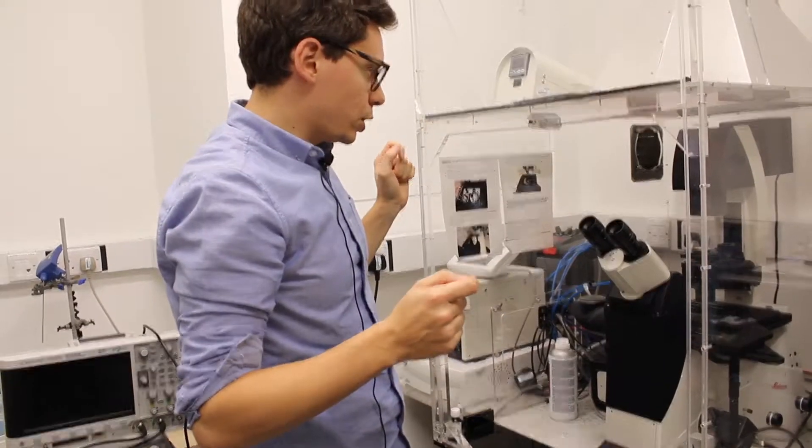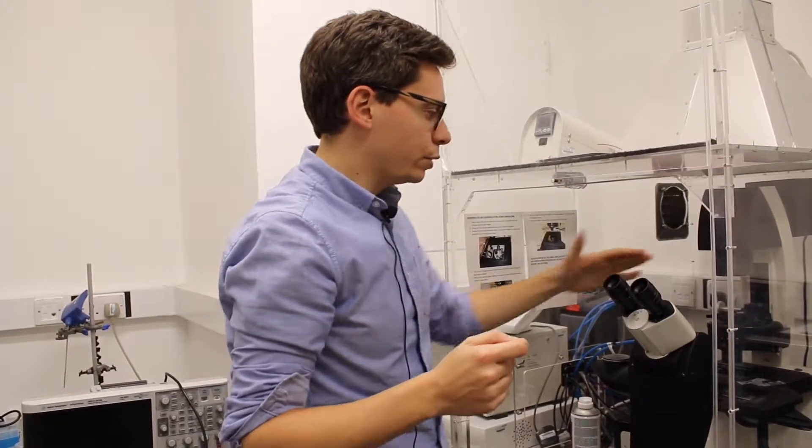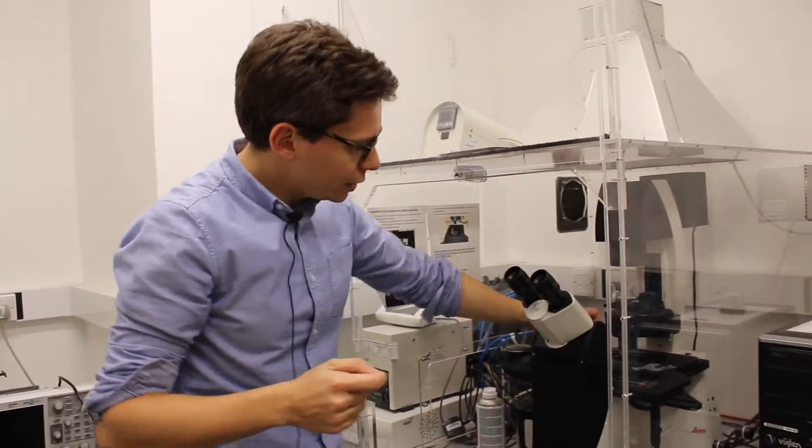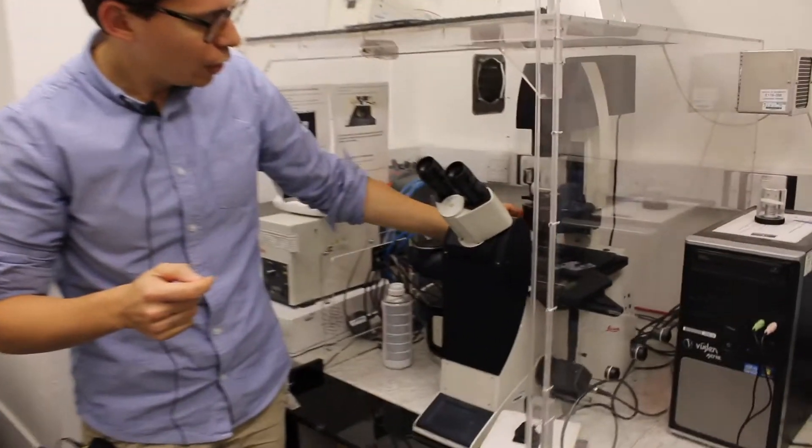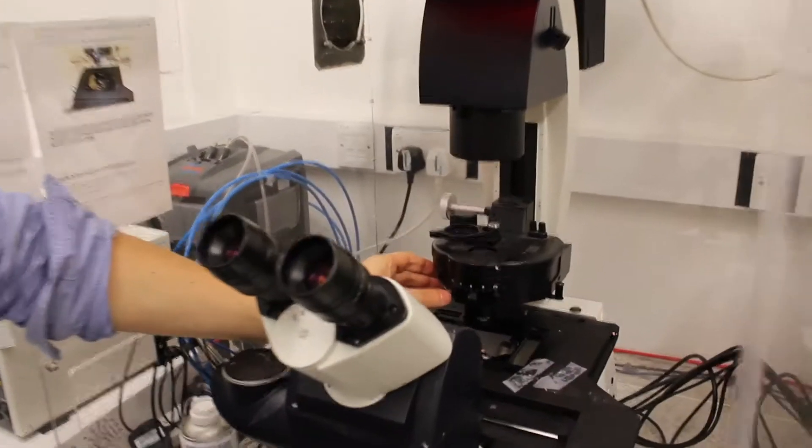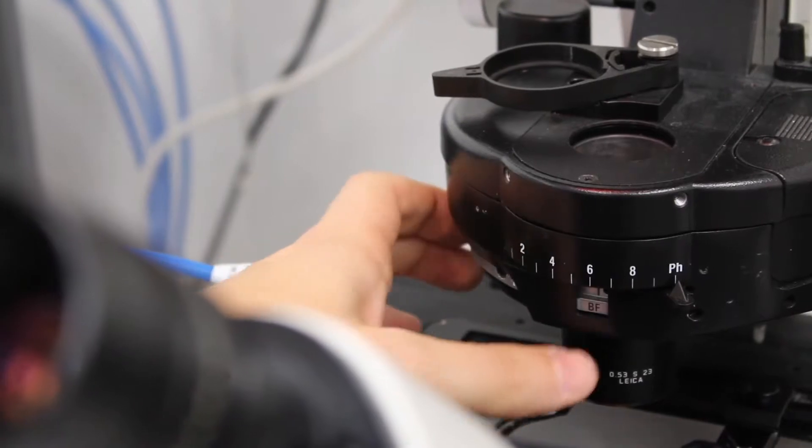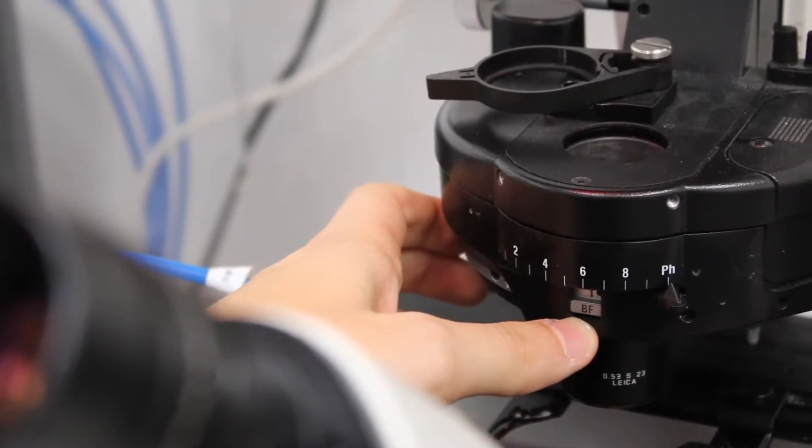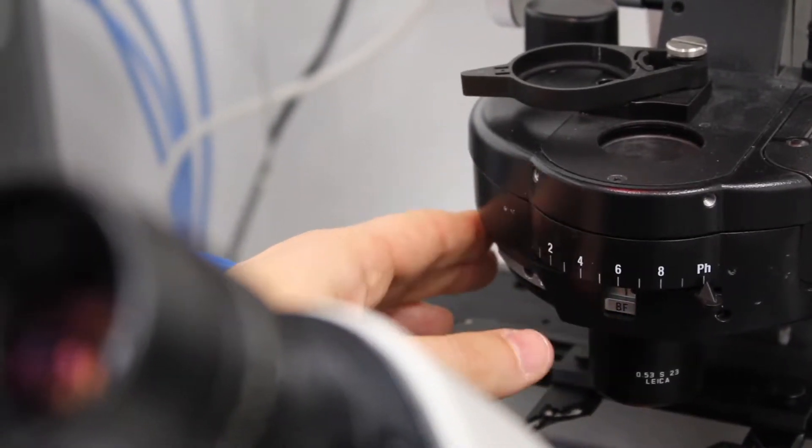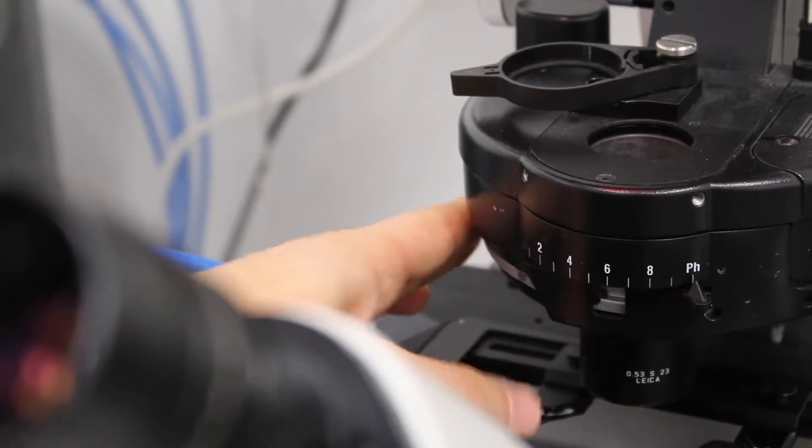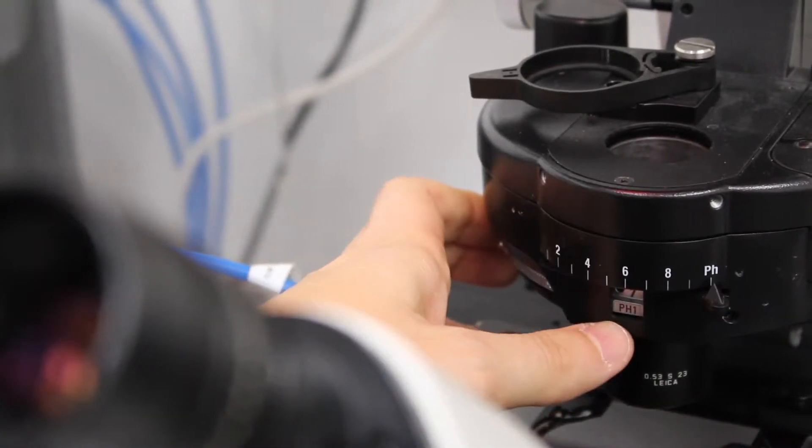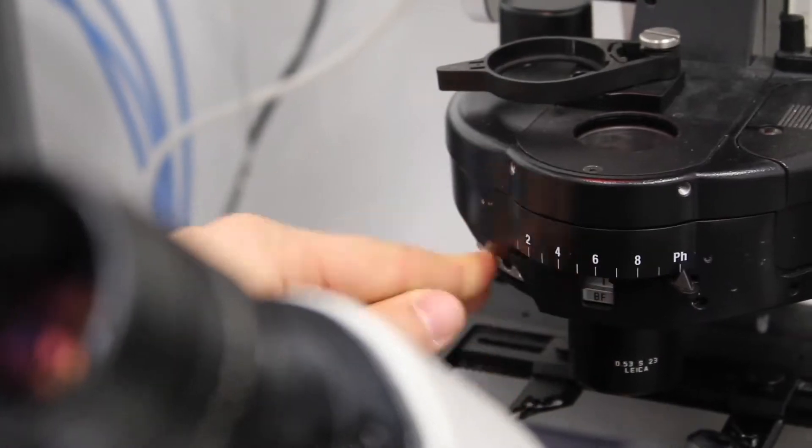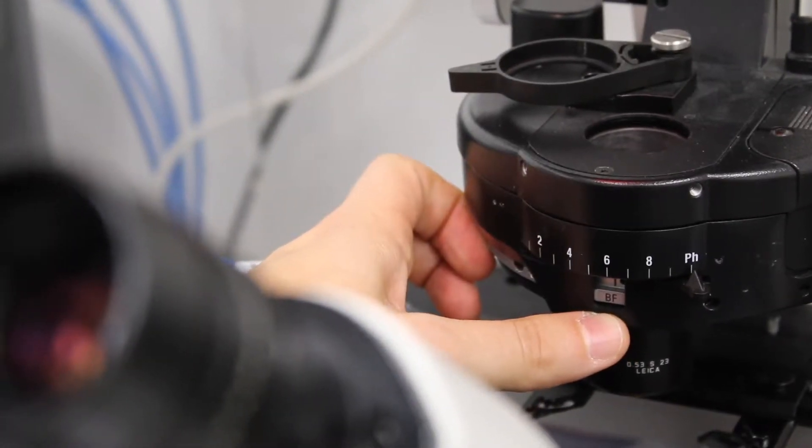Then you need to check a few things before you start observing your sample. The first thing is that this grey wheel here, you are on BF, which is Brightfield. There are other modes in this wheel that turn like that. Ph is phase contrast, for example. First thing you have to check is that it's in Brightfield mode.